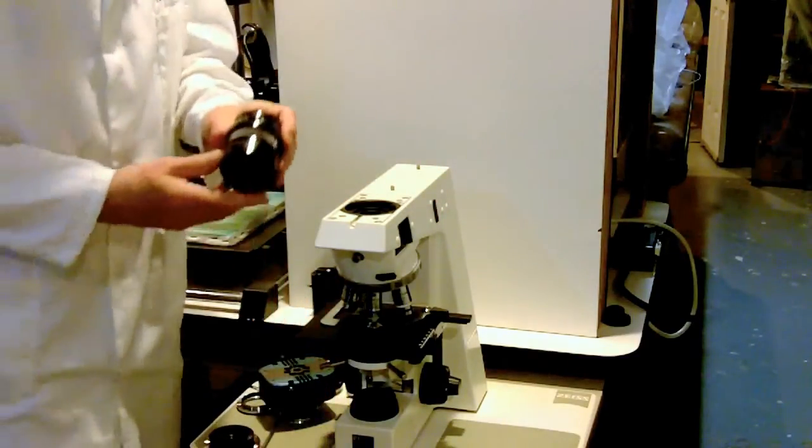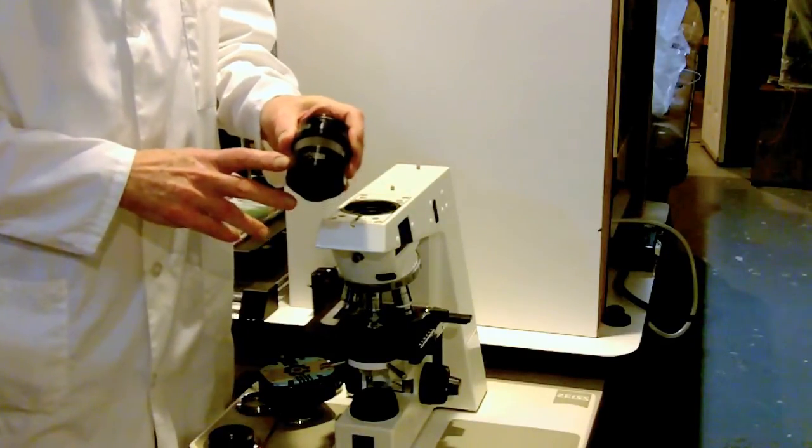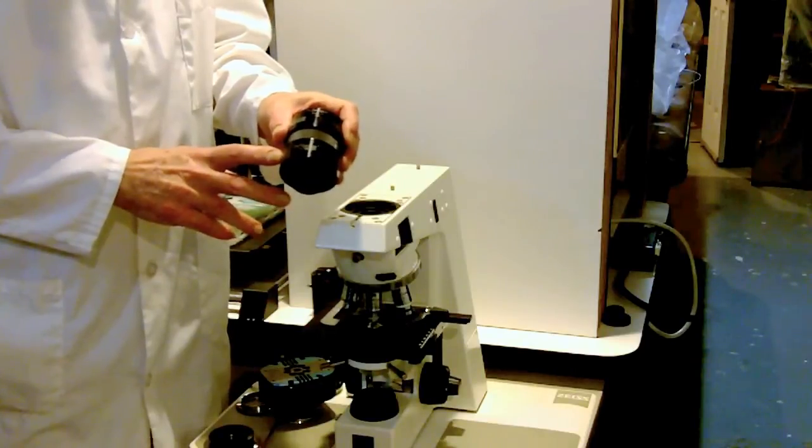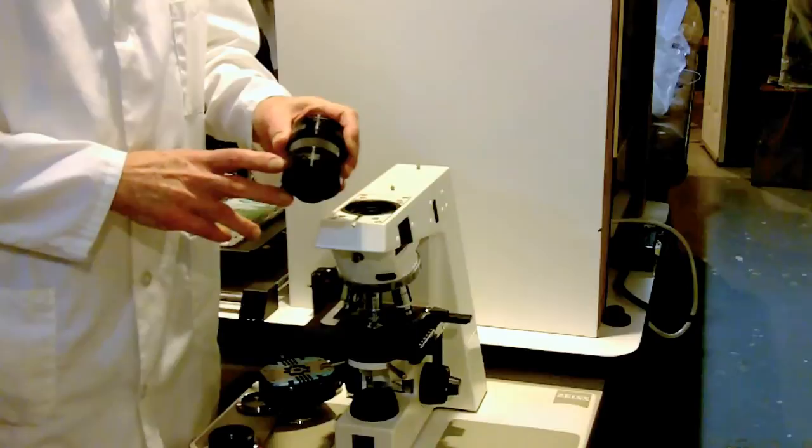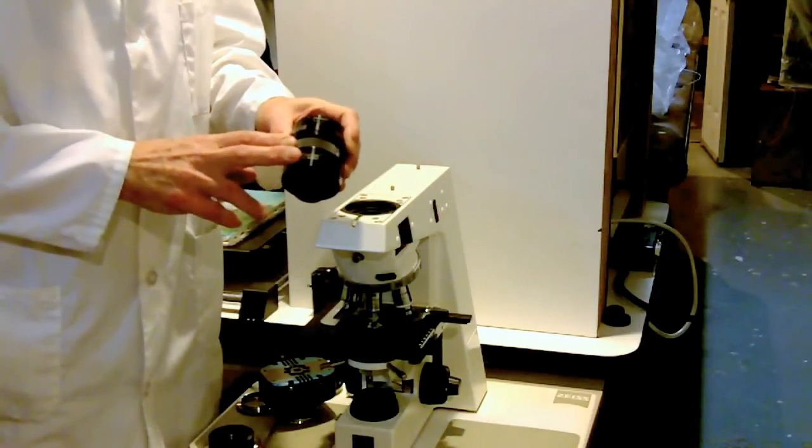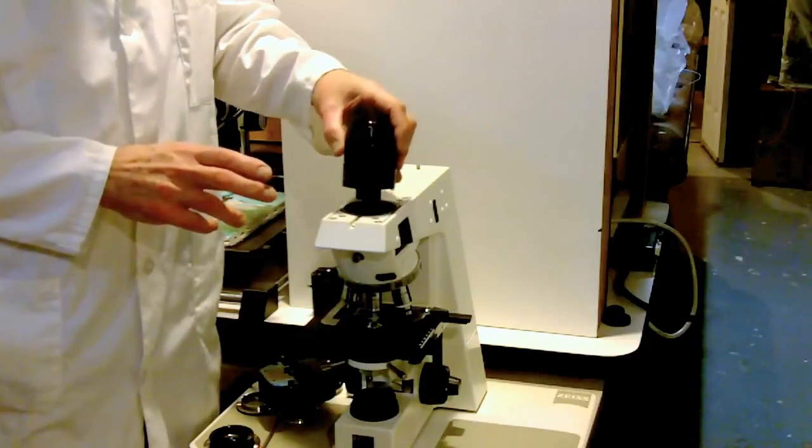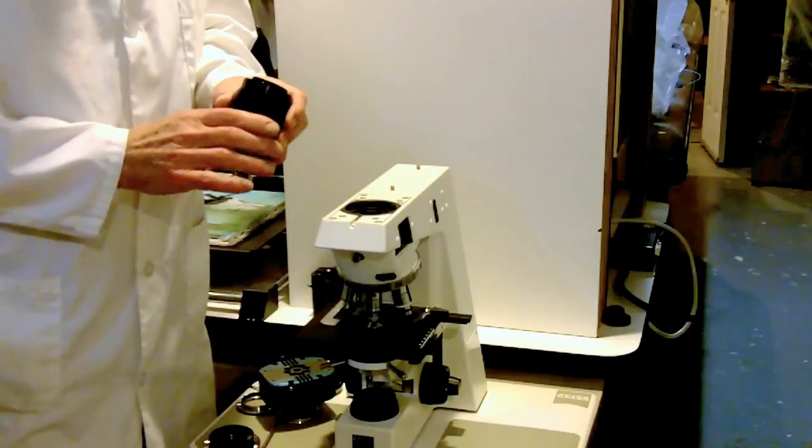The key component is a brand new USA made product from Infinity Photo Optical in Boulder, Colorado. The product is called InFocus and the prime mission for this component is to actually replace the body tube with eyepieces and go directly to a camera.